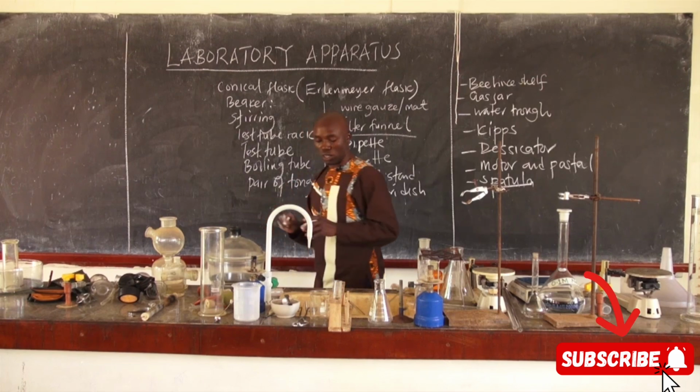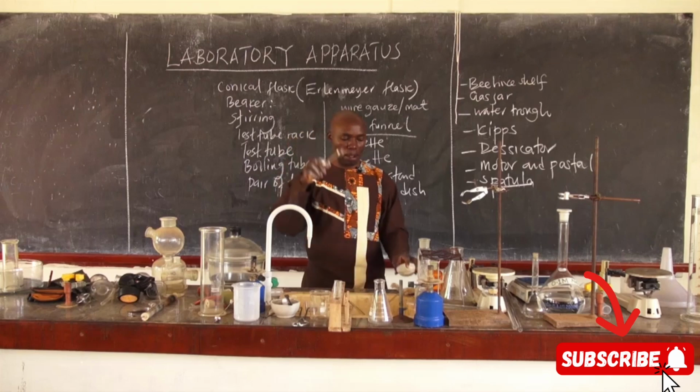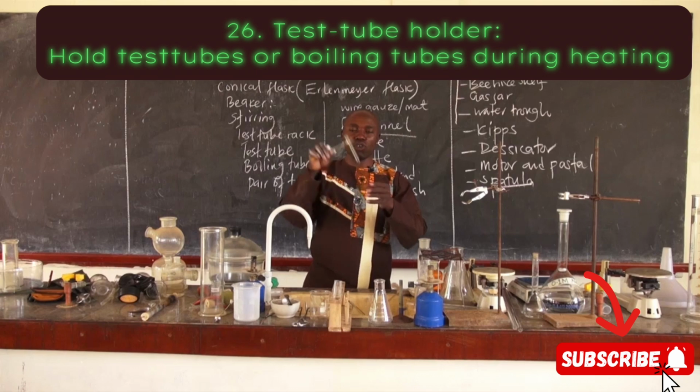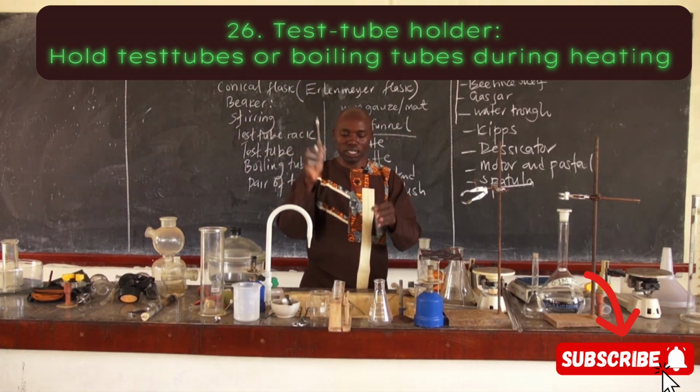Then I will also introduce to you what we call a test tube holder. This is used to hold the test tubes during heating purposes, or used to hold boiling tubes. So this is called a test tube holder.